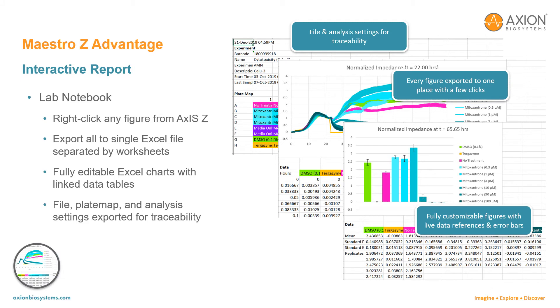AXIS-Z's interactive report, called the Lab Notebook, allows you to export figures and data tables directly to Excel. Simply right-click on a plot in the AXIS-Z software to send that plot and its underlying data to the Lab Notebook. The Lab Notebook contains fully customizable figures with live data references and error bars. The plate map and analysis settings are exported as well for traceability.